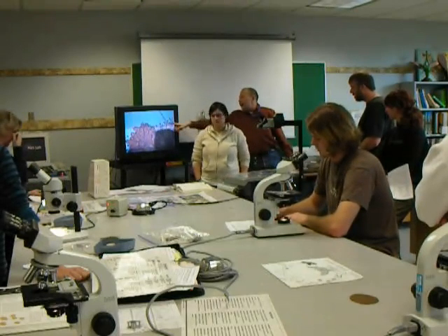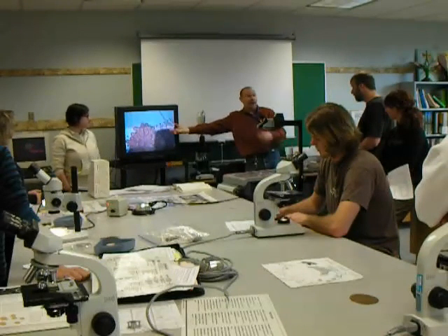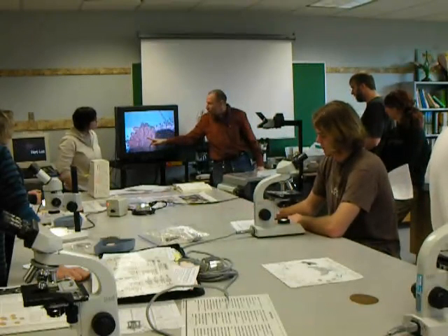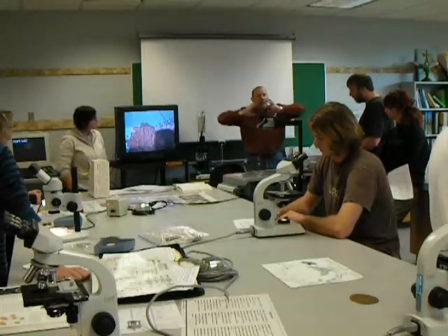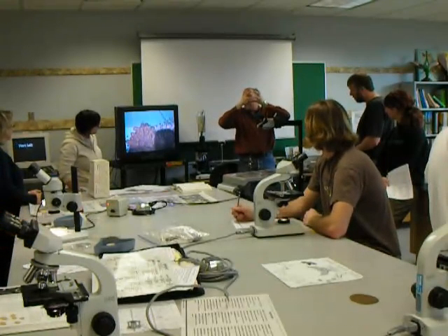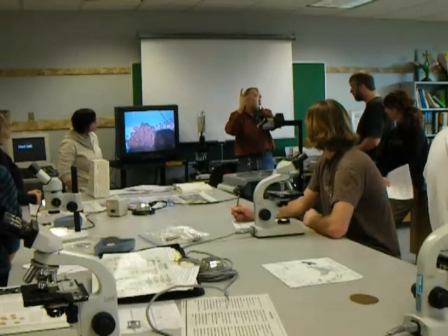By looking at the types of appendages on the chasmothecium — this one has a swollen knuckle where it joins under the chasmothecium body itself — and inside, we have a cluster of asci and the spores starting to develop. What happens is the chasmothecium is on the leaf; these are the appendages. As it dries out, the appendages shrink up like this, and it breaks it open, and that's how it's going to release the spores. It's just gotten a hole in it.